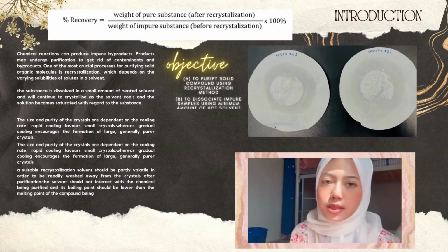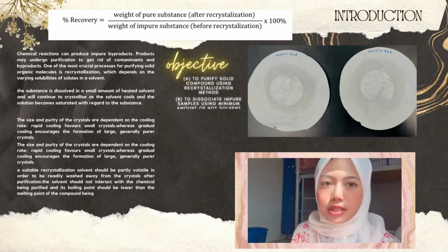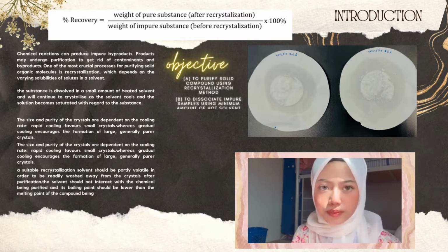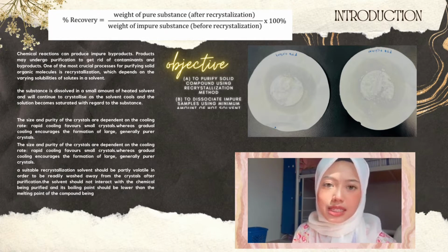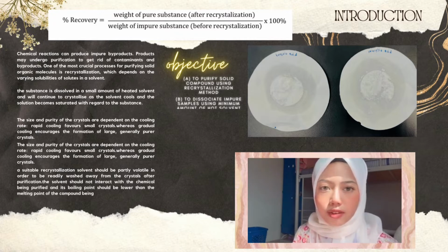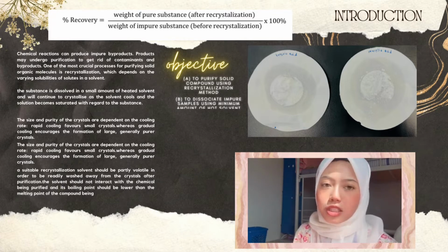The right solvent must be used in order for recrystallization to occur. The substance must dissolve in the hot solvent and become insoluble in the same solvent when it is cold. The amount of product recovered after recrystallization, in terms of solvent selection, depends on the difference between the hot and cold solubility. The size and purity of the crystal are dependent on the cooling rate. Rapid cooling favors more, smaller crystals, whereas gradual cooling encourages the formation of large, generally pure crystals.